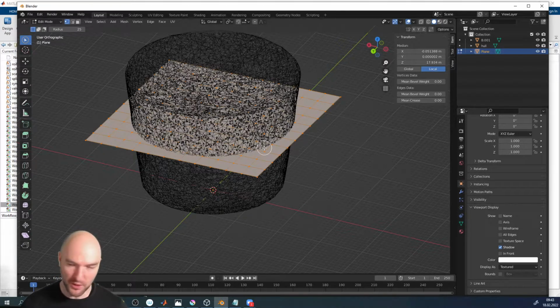Okay, so what step size is a good step size is kind of the same thing we talked about yesterday with the voxelization. There is no good choice. If you make it very small, you're going to have low statistics. If you make it very large, you're going to have low resolution.